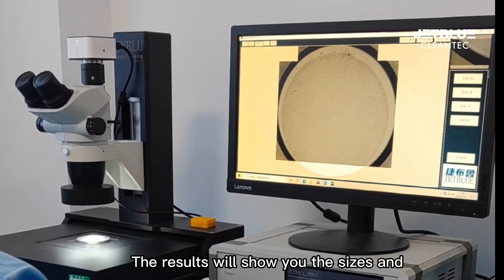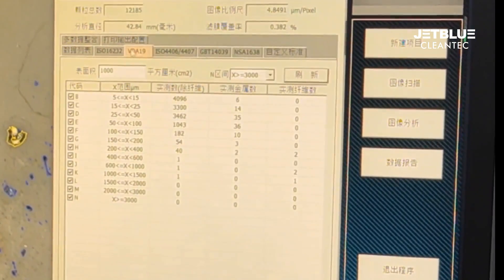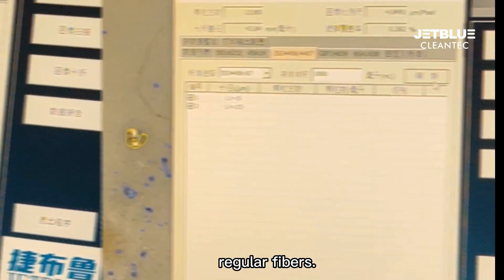The results will show you the sizes and numbers of reflecting particles, reflecting fibers, regular particles, and regular fibers.